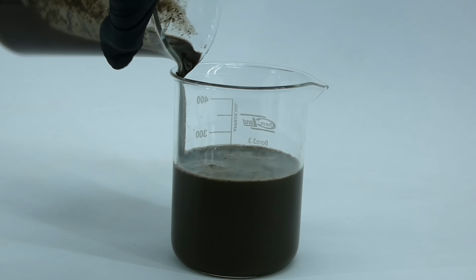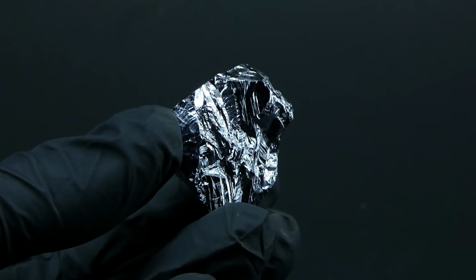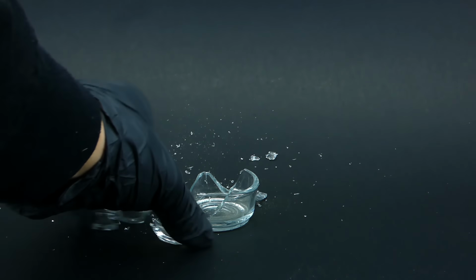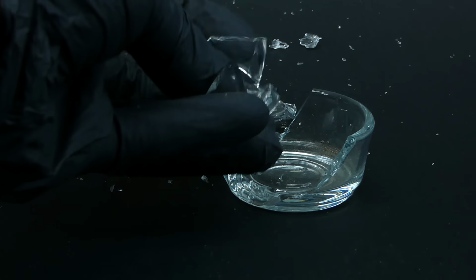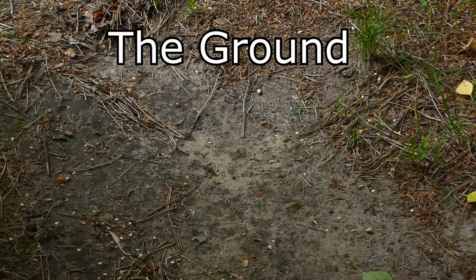So, in today's video, I will be transforming some dirt into pure silicon dioxide, which I will use to make some elemental silicon and silane in future videos. Silicon dioxide is a major component of most rocks, sands and glass, and it is just extremely abundant. However, it is pretty rarely naturally found in its pure form, and the most common place where you can find impure silicon dioxide is literally the ground.